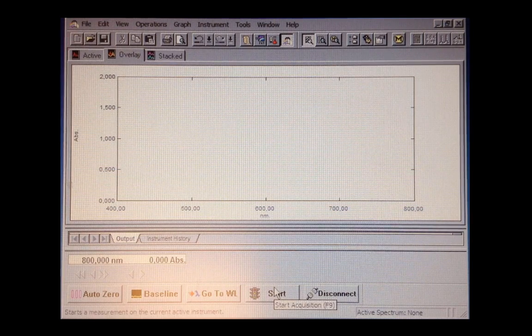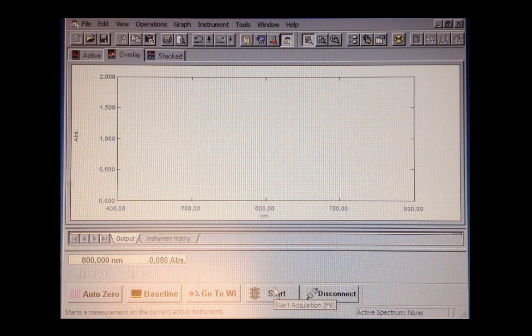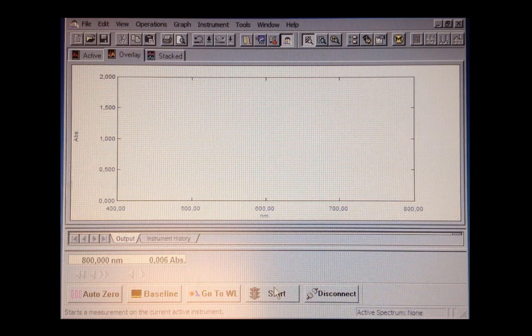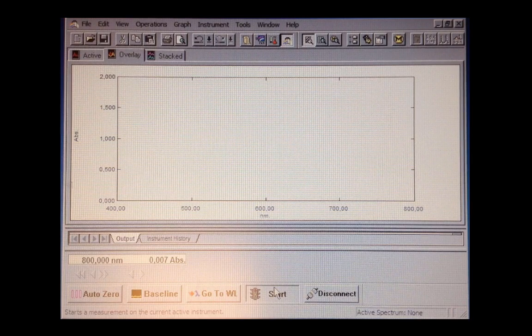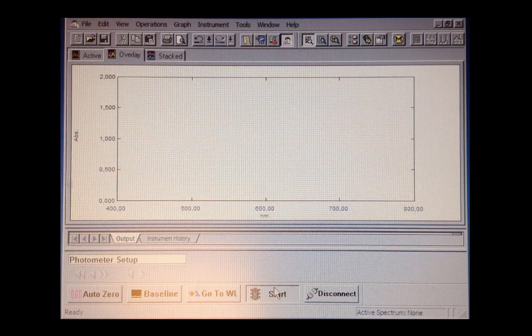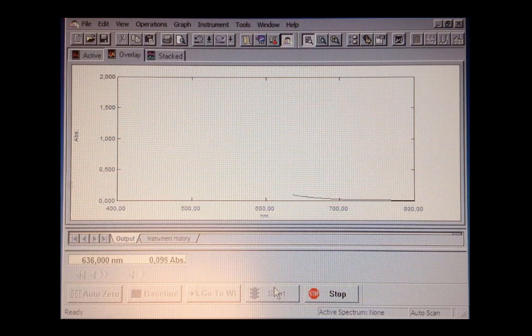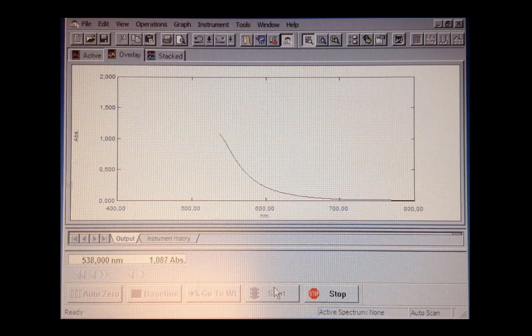After that, you just prepare your sample and put your sample inside the sample holder. Be prepared and then click start. The spectra will be shown as the scan goes.